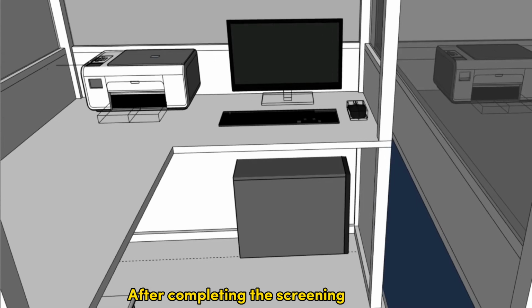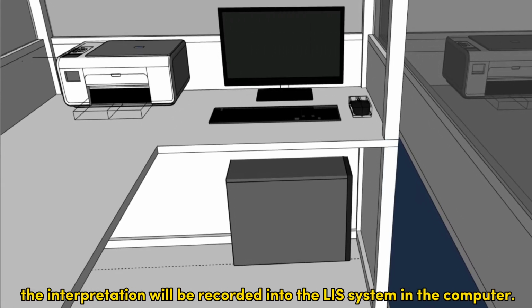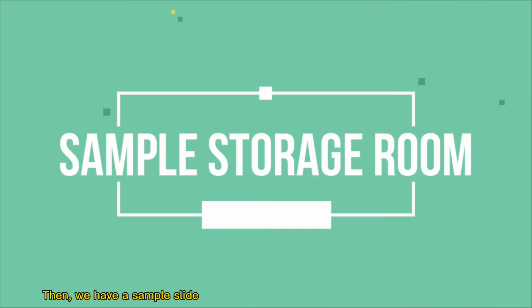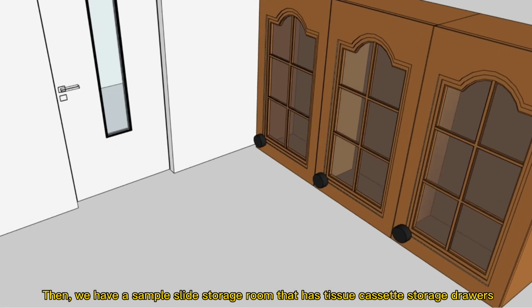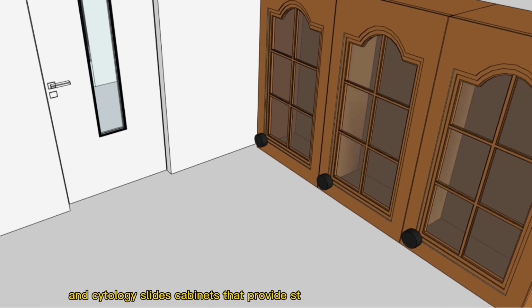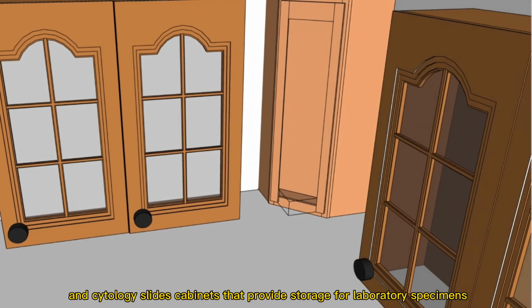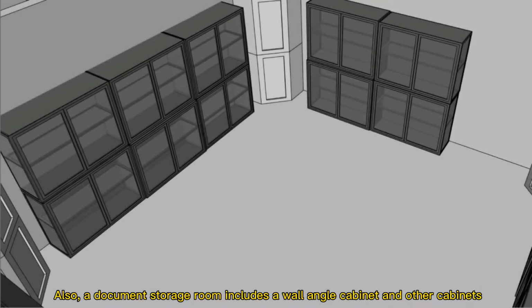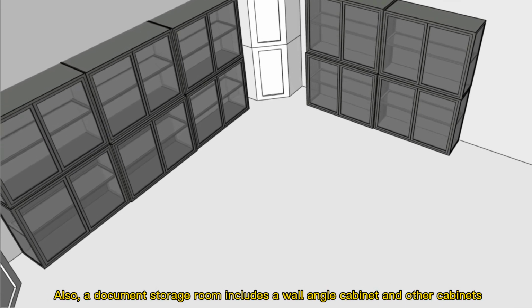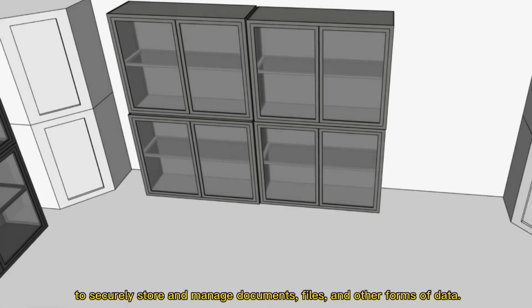After completing the screening process, the interpretation will be recorded into the LIS system in the computer. Then, we have a sample slide storage room that has tissue cassettes, storage drawers, and a cytology slide cabinet that provide storage for laboratory specimens and paraffin blocks in hospital and lab environments. Also, a document storage room includes a wall angle cabinet and other cabinets to securely store and manage documents, files, and other forms of data.